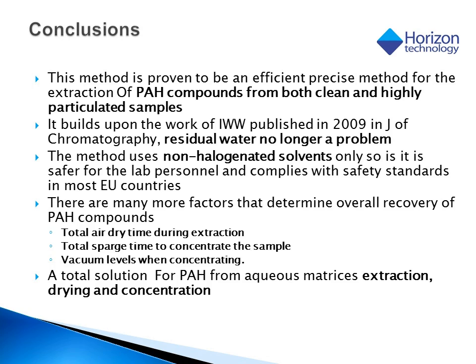So in conclusion, I just want to state that we have developed and demonstrated an efficient method for the extraction of PAH compounds from water samples using C18 extraction discs, and a method that employs non-halogenated solvents. This work builds upon the earlier work done at IWW, but this time uses a solvent system that allows the use of dry disc technology to get rid of residual water.